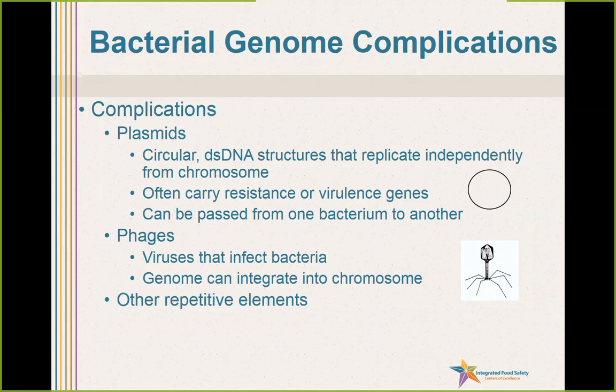There are also other repetitive elements that are hard to analyze because we don't necessarily know where they go or how many times they are repeated. They are important because they can cause difficulty in putting together an assembly.